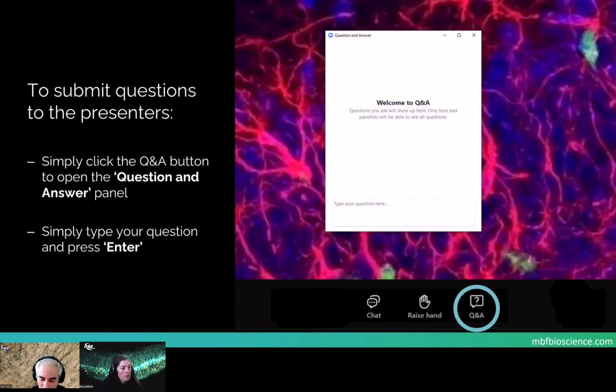And we have a question about IBA1 and different stages. Yes, we know about these. We don't have right now any specific classifier for different stages of activation. We'll need to train that, and probably there will be different classifiers. We've been approached by some people about microglia activation state. If you are interested in that, we'd be really happy. The more data you provide, the more robust the classifier will be with extra training. So yes, please upload those different IBA1 states.